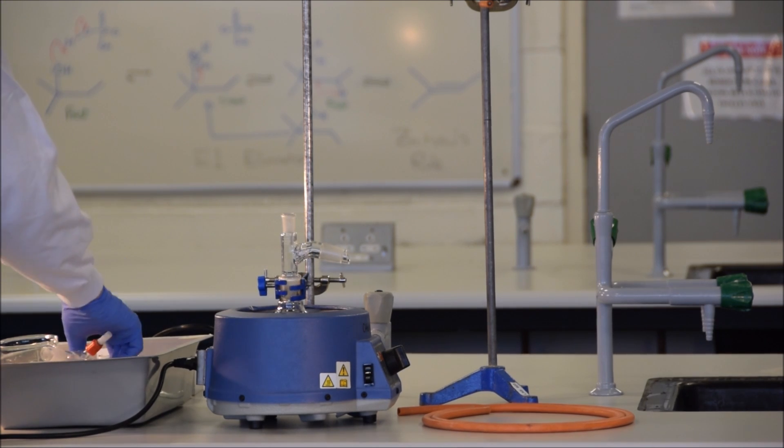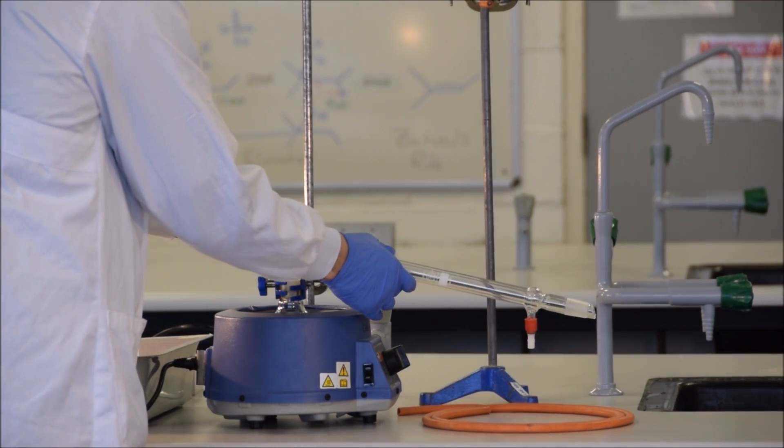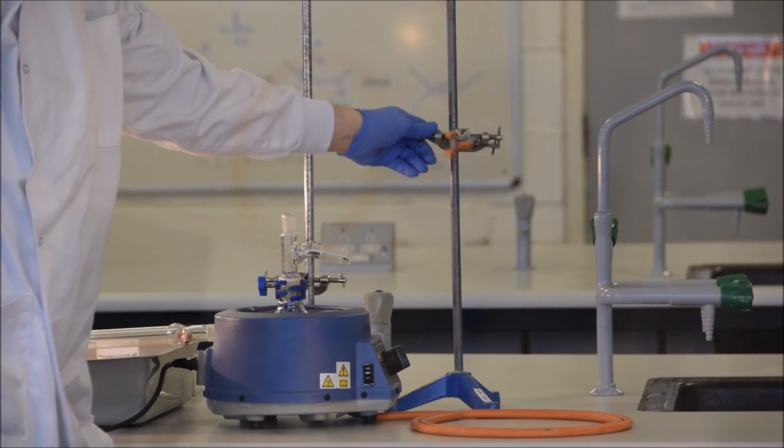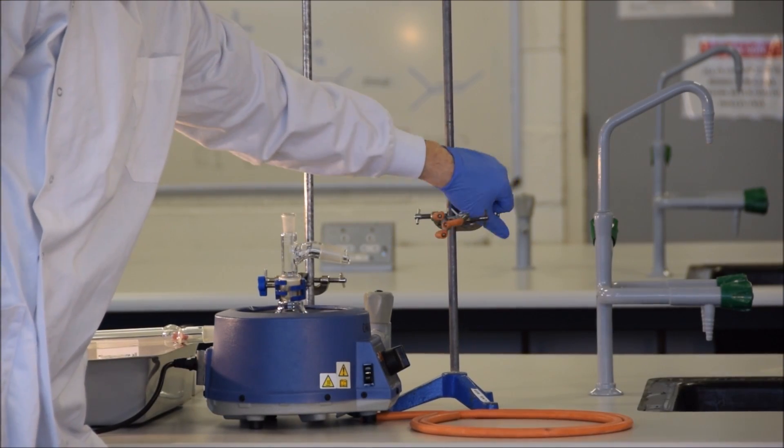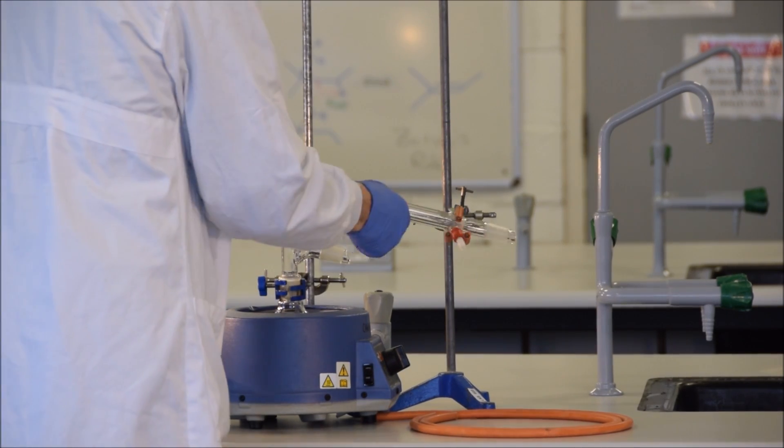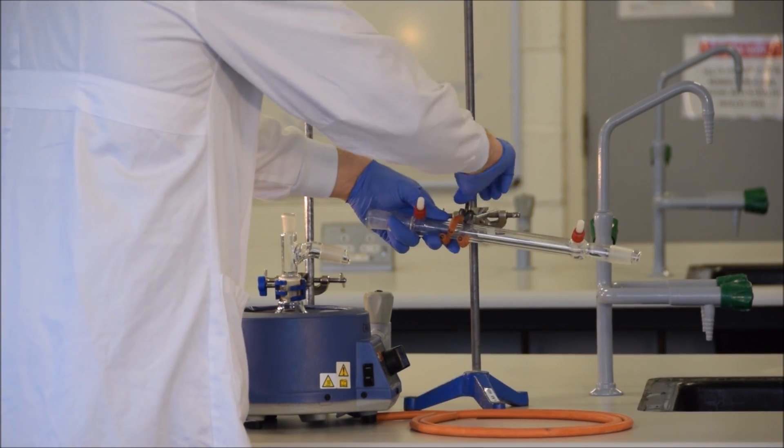Next, I put in the still head. Following the still head, I put in the Liebig condenser. You'll notice now that the Liebig condenser will need to be supported by another clamp. So again, we follow the same procedure. Loosen all three screws. Securely clamp your piece of glassware, and then adjust the distance and the height of the piece of glassware, so that it is held securely in the correct position.